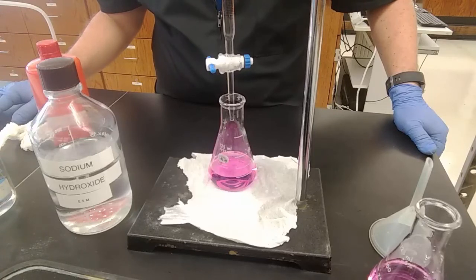You have successfully figured out the percent by mass to volume of acetic acid in vinegar once you finish your calculations.